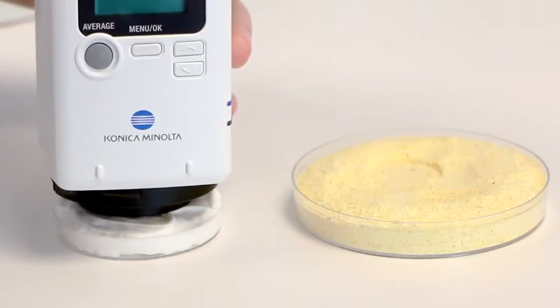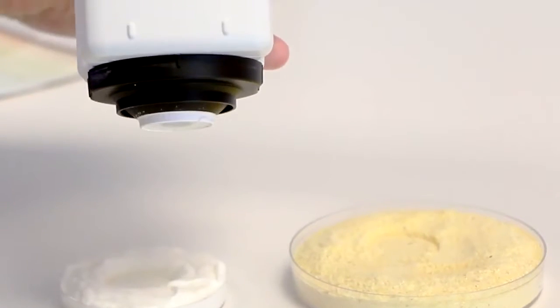Specular Component Excluded allows you to measure textured, matte, and glossy surfaces.